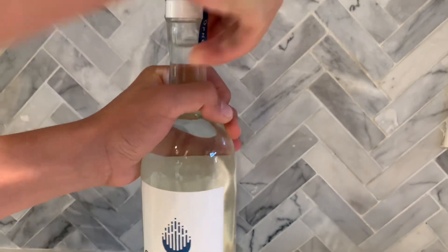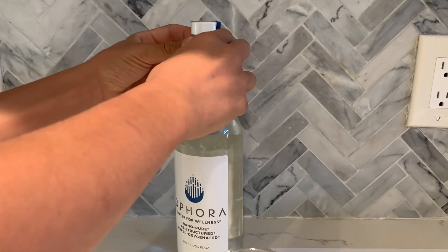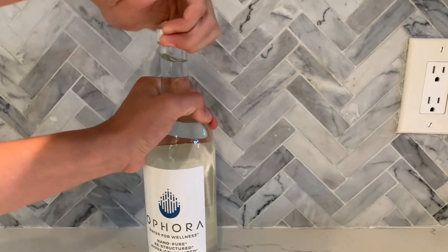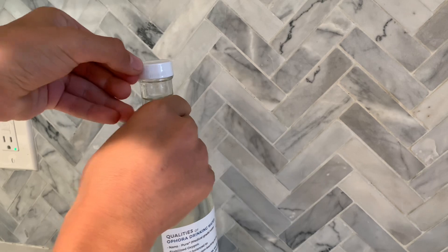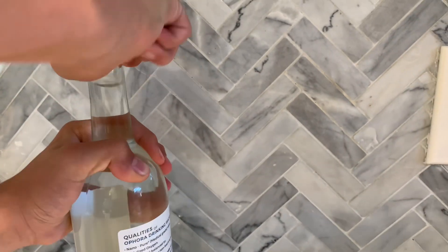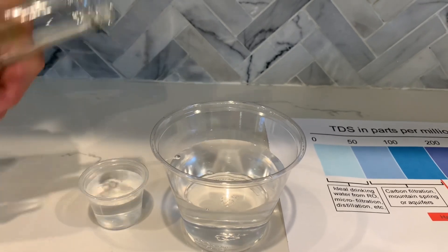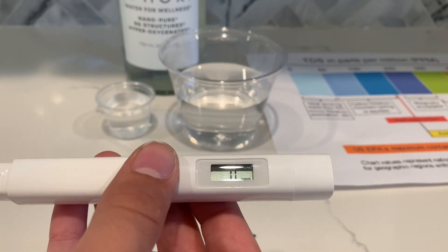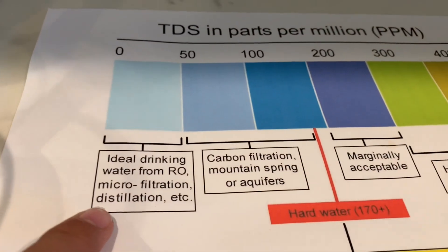Let's test the water. Let's pour some water in. First, let's test the TDS level. Turn on the TDS tester. Make sure it says 0 and put it in. The result is 15 — that is micro-filtered distilled water.